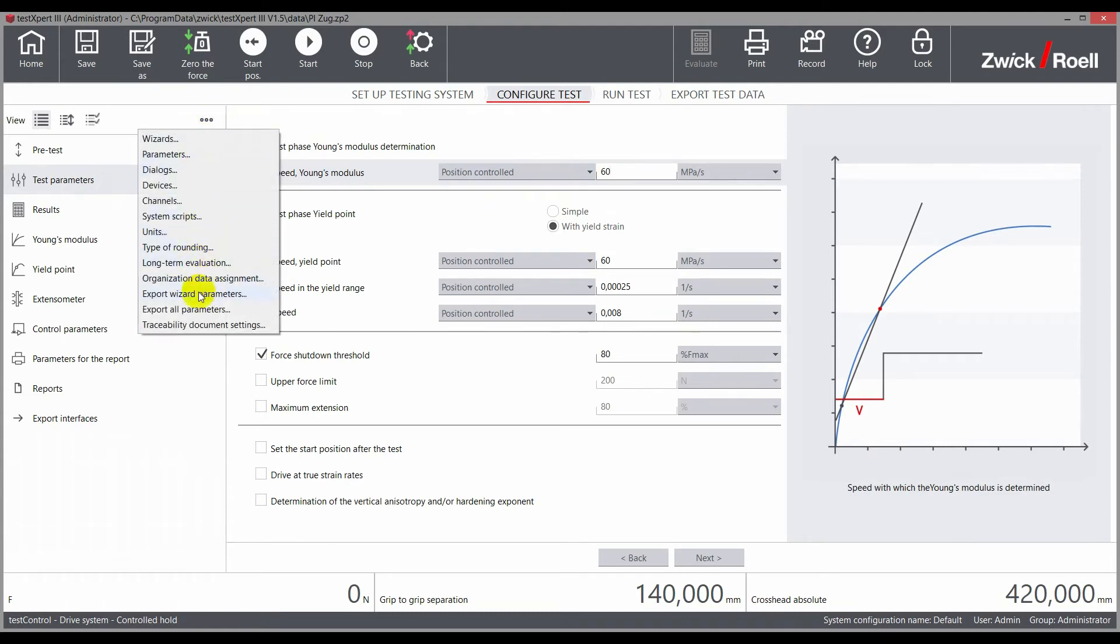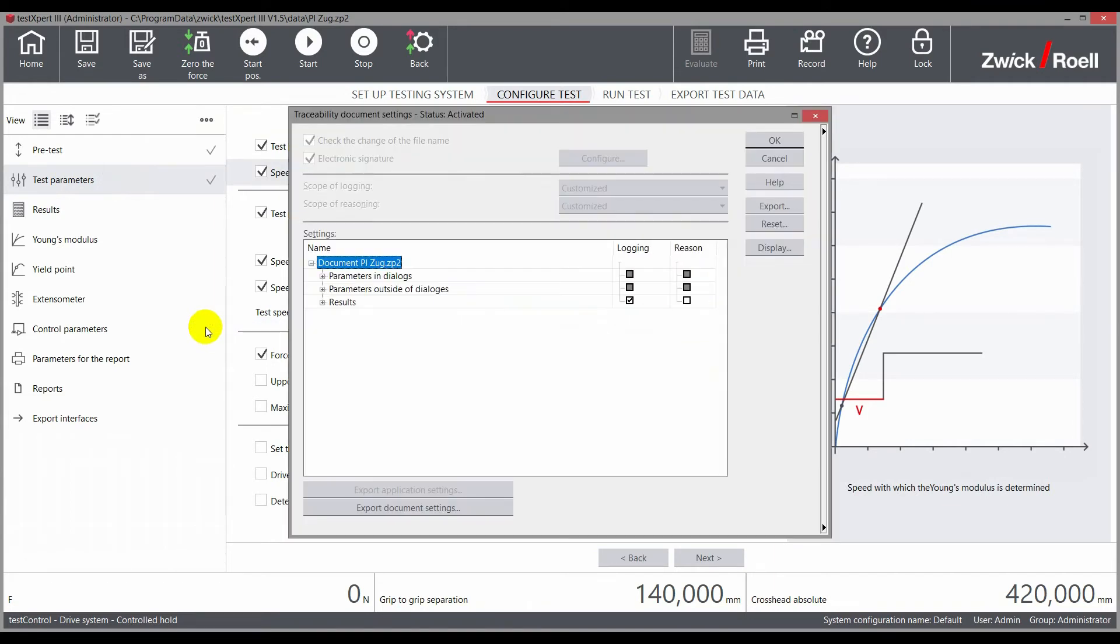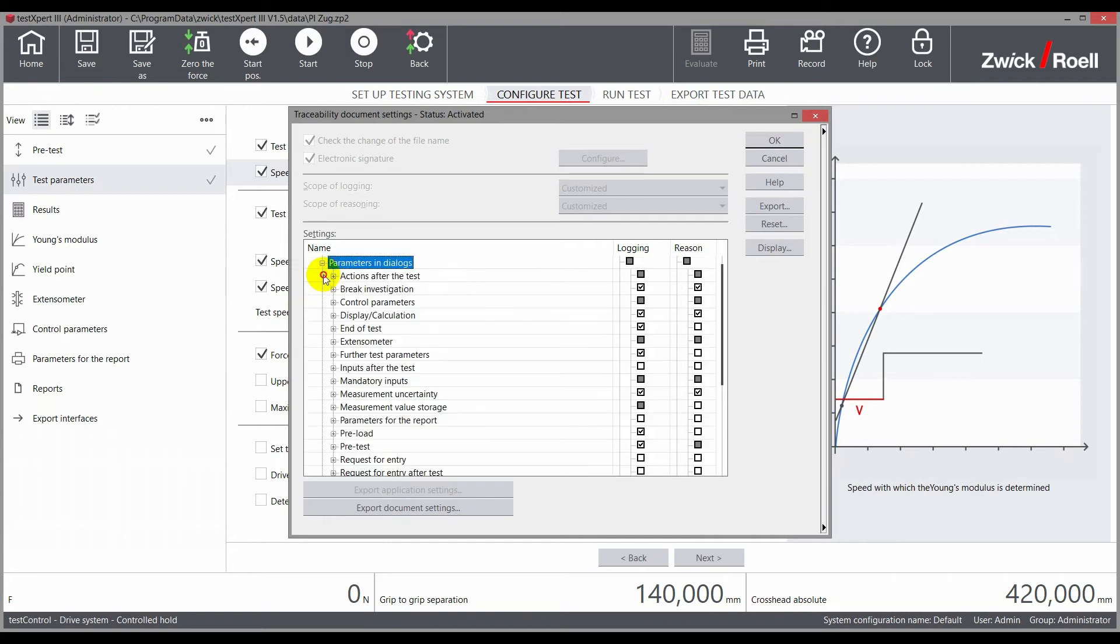Within a test program, traceability can be defined down to the parameter level, according to individual specifications.